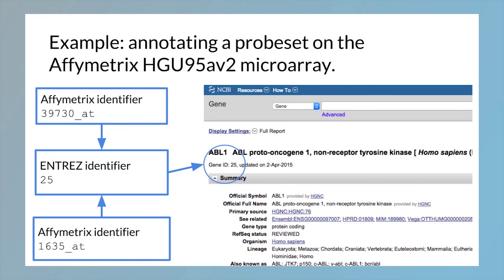Entrez is a meta database hosted by NCBI, which is kind of a union or a superset of a lot of different databases hosted by the federal government. Once we have the identifier — in this case this probe set maps to gene number 25 in the database — we can look up gene number 25 and learn that the gene symbol is ABL1, and we can learn a lot about where in the genome the gene is and what kind of function it has.